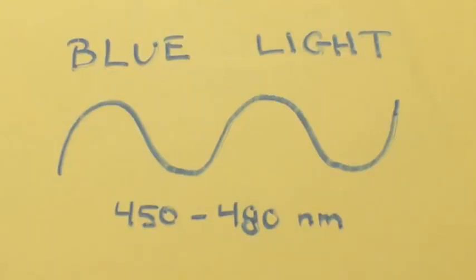As promised, I'm going to tell you how to make blue light between 450 and 480 nanometers. As we discussed in the last series of videos, called benzyl chloride via free radical halogenation, we need between 421 and 494 nanometers.